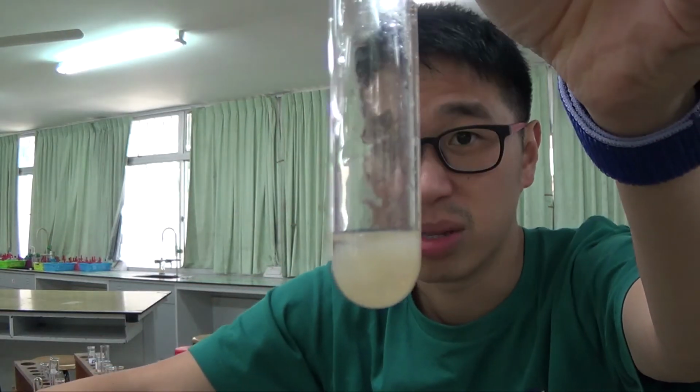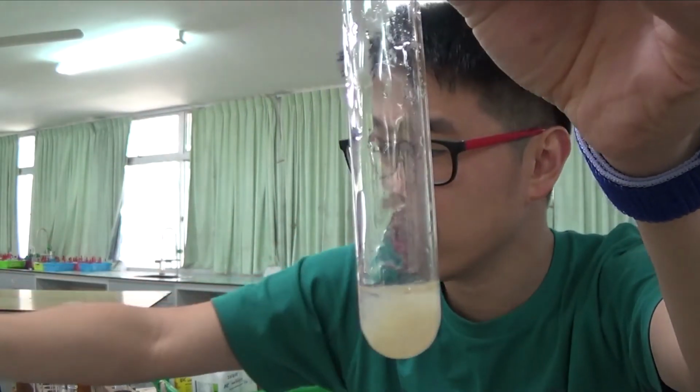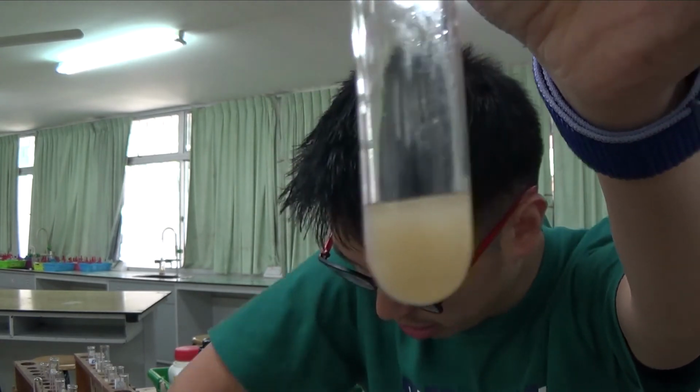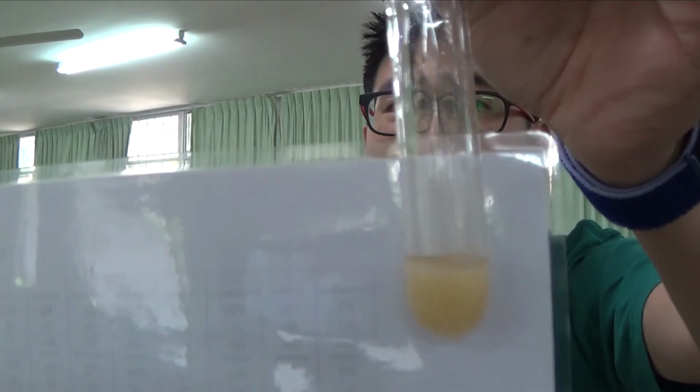So again, I think it's gone off-white very quickly. Yeah, okay. You can tell apart white precipitate and off-white precipitate. Hope you can tell that it's not exactly white. Okay, and it's not pink as well. This is kind of creamy, like coffee color. Not too sure how the color saturation or the balance will be like in these videos when they turn out.